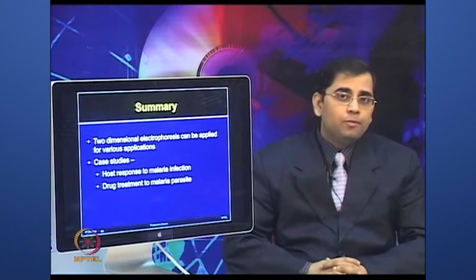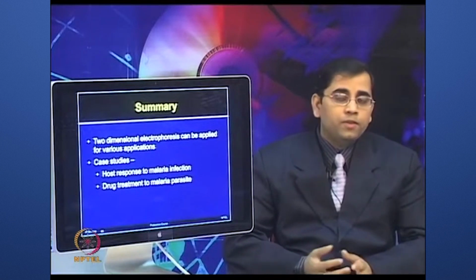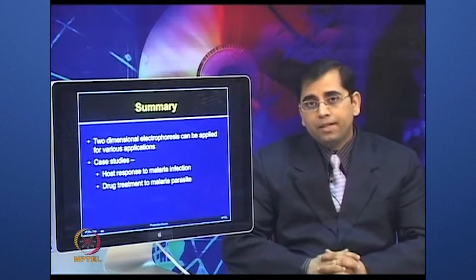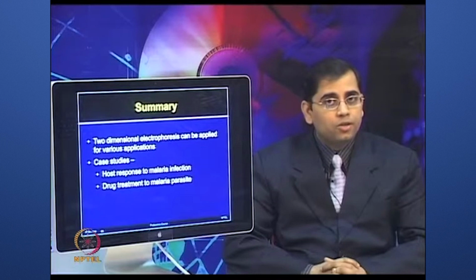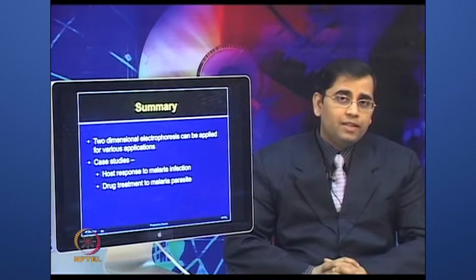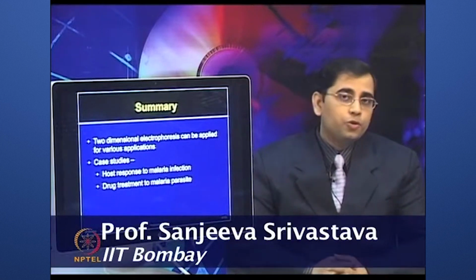So, today we discussed not only one application, how host serum proteins change due to one of the Plasmodium parasites, but also the various nitty-gritty experiments one needs to perform to achieve such a comparison. We will continue our discussion on some more applications of two-dimensional electrophoresis and also two-dimensional difference gel electrophoresis, because due to the variations in 2DE, people also try two-dimensional DIGE experiments, which are very sensitive. So, that also expands the overall proteome coverage.